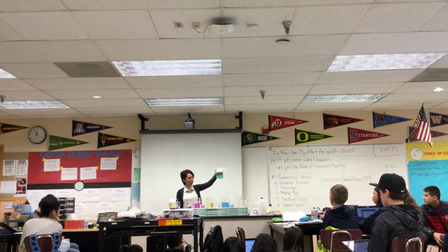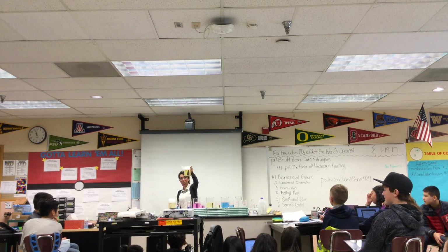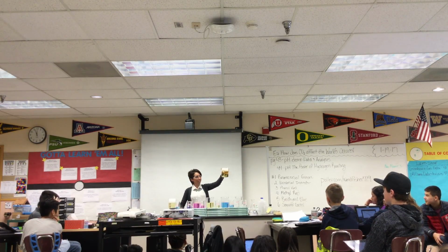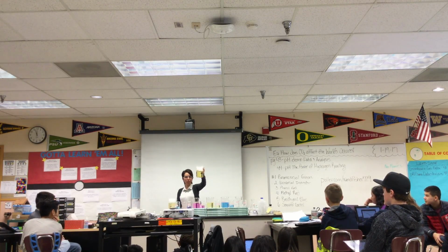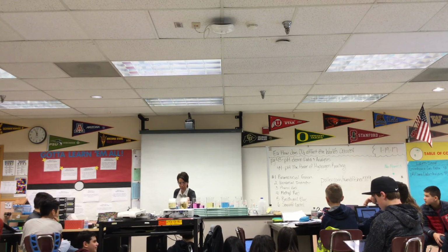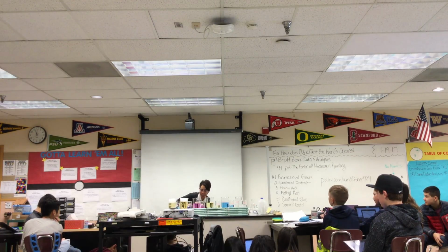A little bit more green. And whoa! There we go. Now we got some yellow going on. All right, and it'll probably stay around yellow. We might get a little bit of a dark orange. We're gonna let that one go for just a couple more seconds. We'll come back to that one because I can always add a little bit more dry ice.